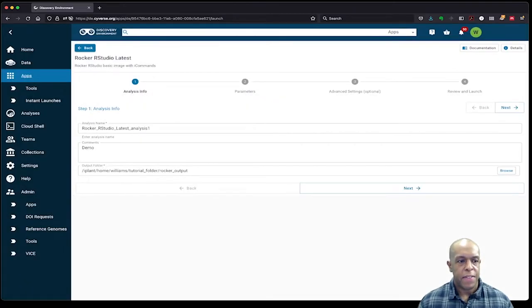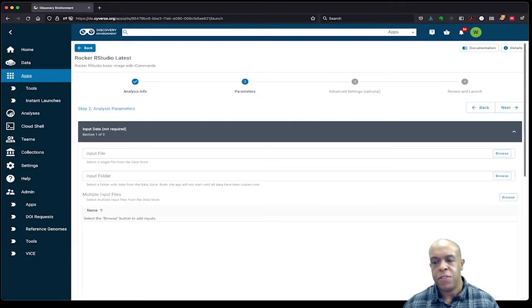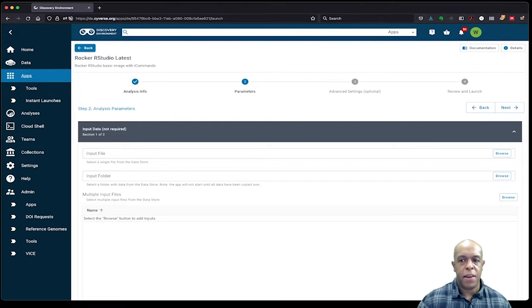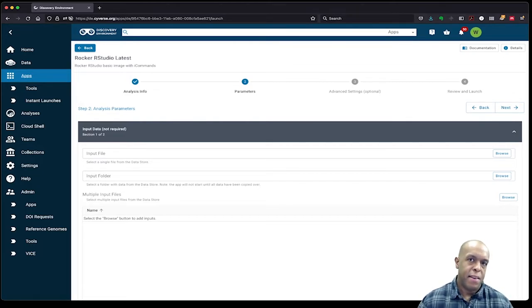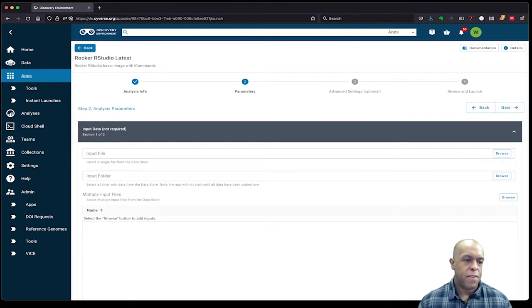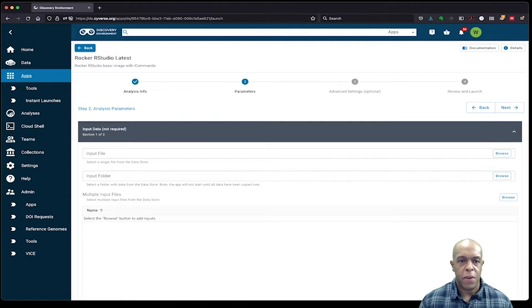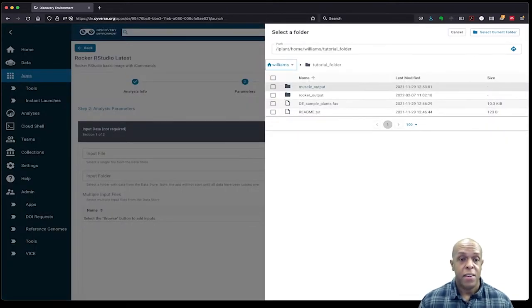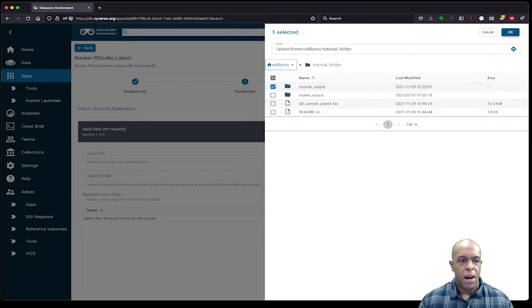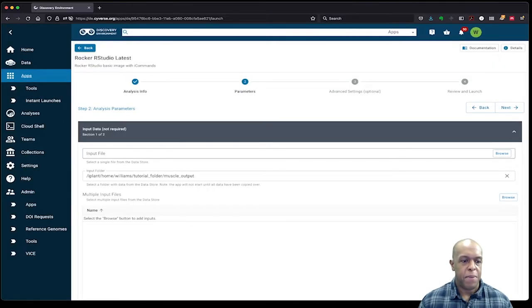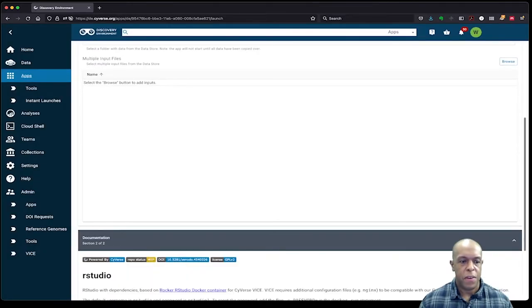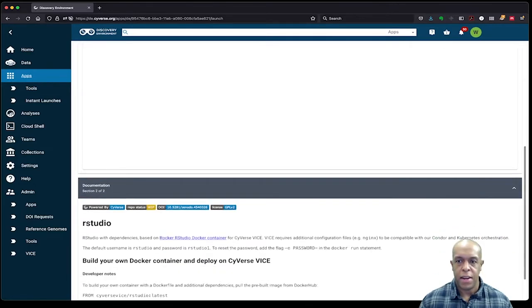Click next. So the next thing is to choose my inputs, and in this case I'm going to choose the muscle alignment that we've done previously that's also available within my tutorial folder. Since my input is going to be a folder, I'm just going to go ahead and browse and bring in the whole thing, and that's my muscle output that's previously created. So I'll check and select that. I'm not going to input anything else, so I'm just going to go ahead and click on next.